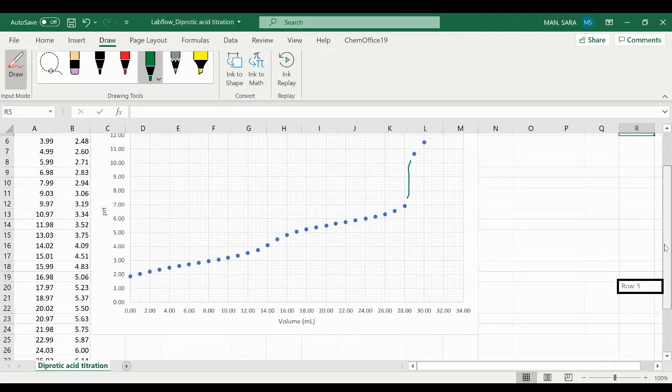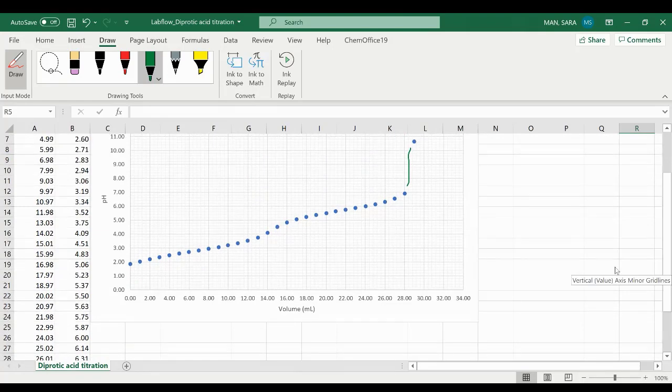And then they ask you to identify the first equivalence point, and that is at half of the volume of whatever you recorded. So basically, they're telling you step by step how to do it. That's why I think the concepts in these experiments are a little confusing. But that's what you have to do.